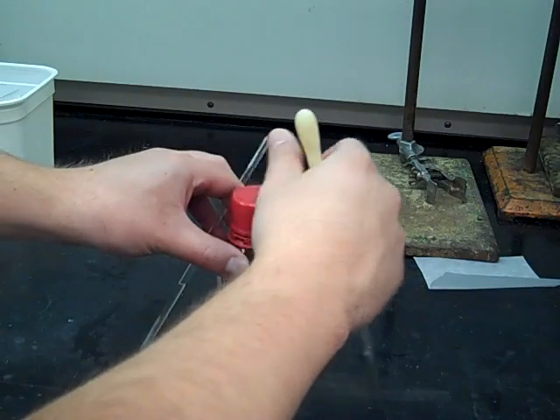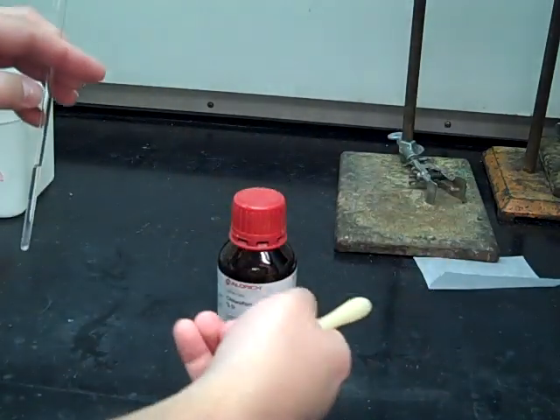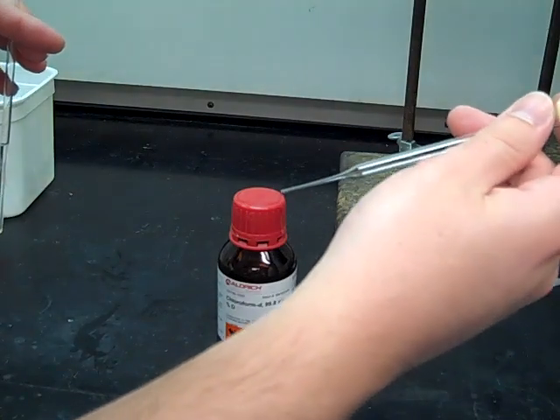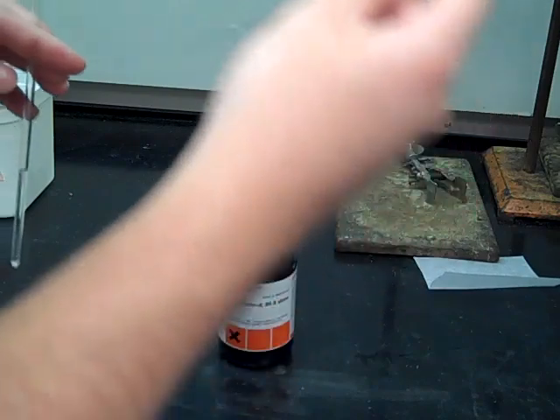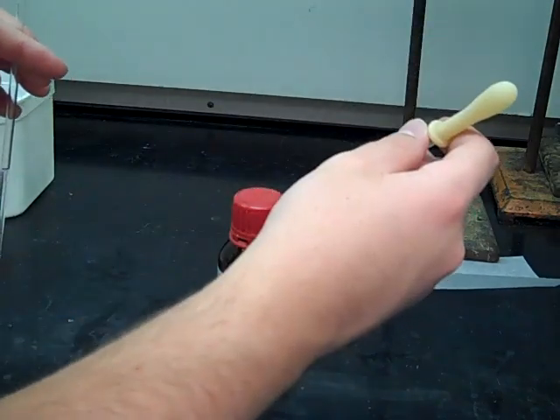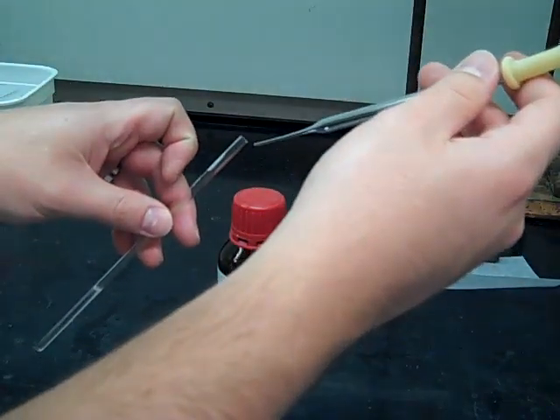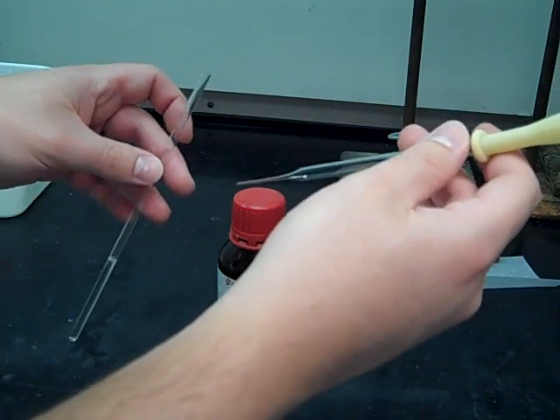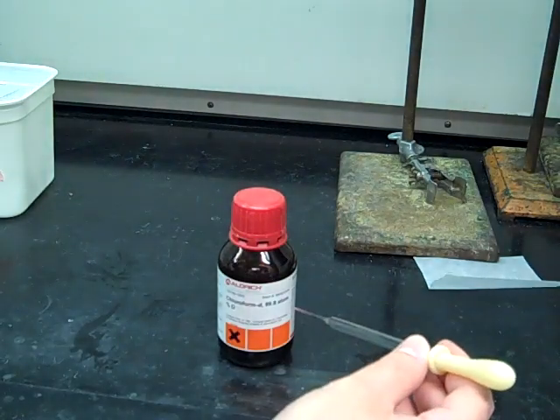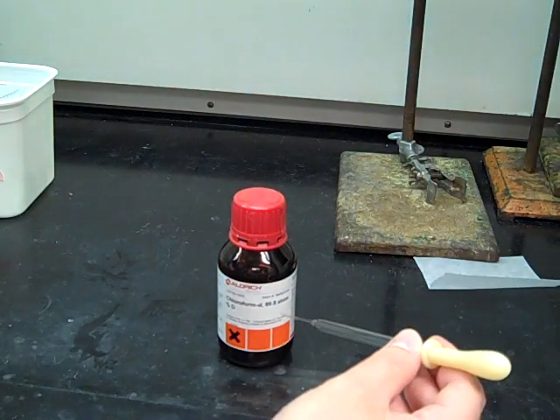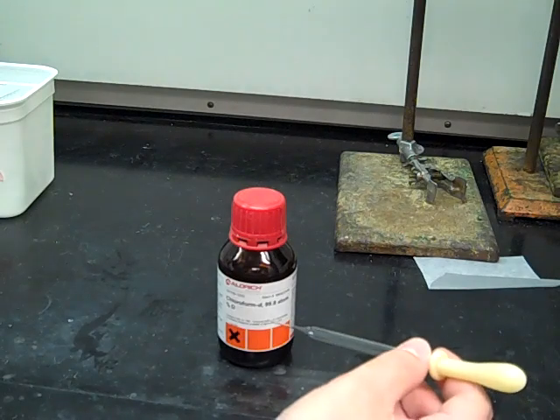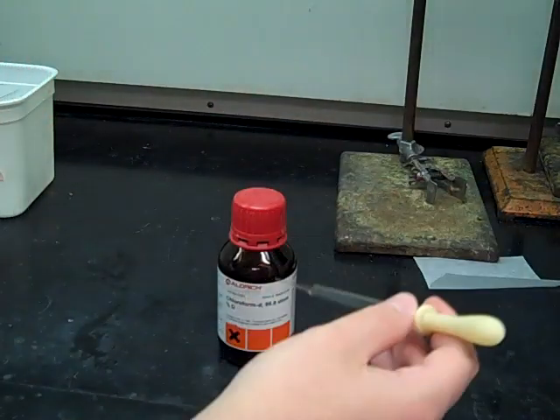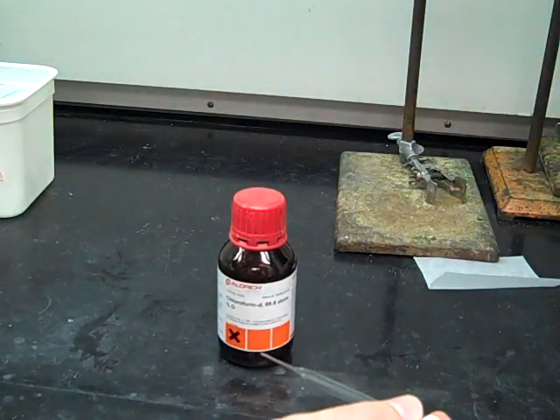One thing that you want to be really important of is not to contaminate this deuterated chloroform. So once you've used a pipette, you want to make sure to dispose of that in the pipette waste and don't try to put the same pipette in again, especially if you've touched the lip of your NMR tube where it could be contaminated with whatever sample you're studying. This NMR solvent is really expensive and if it gets contaminated, we're out the 75, 50 bucks that it costs to get this solvent. So make sure that you're just extra careful about contaminating that chloroform solvent.